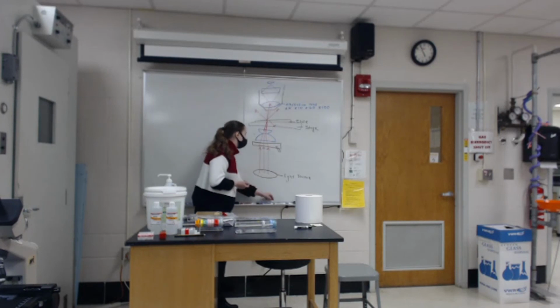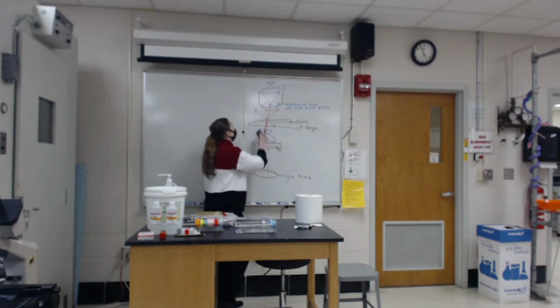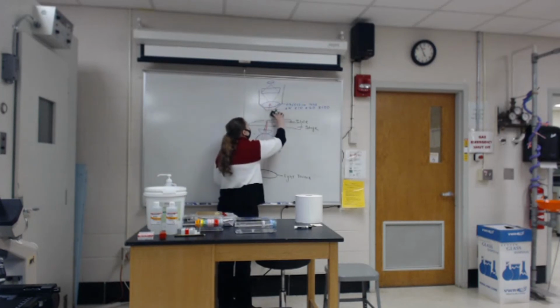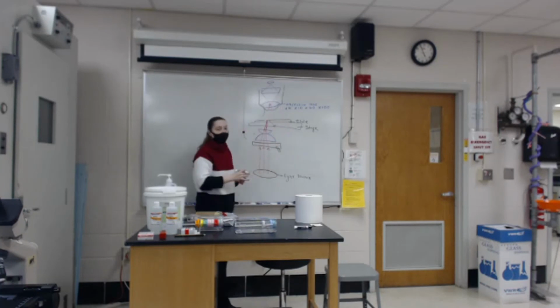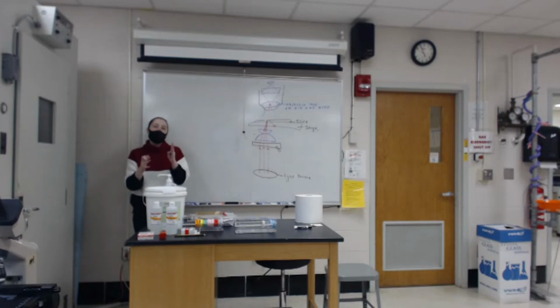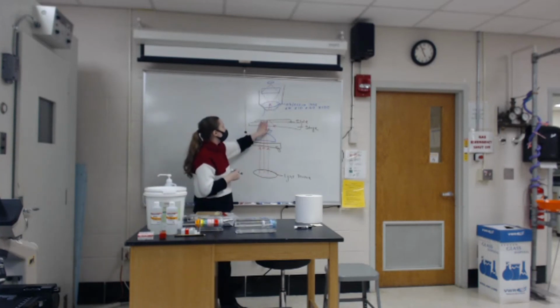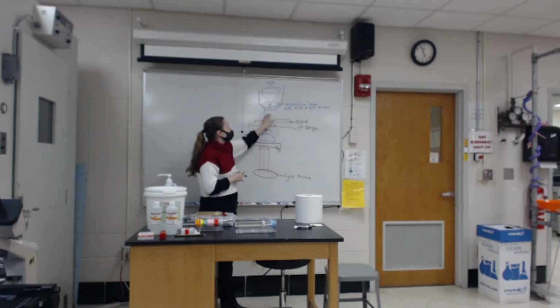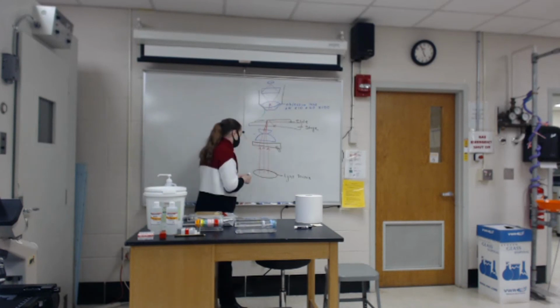So how do we deal with that? We're going to deal with that using the oil. When we're working with oil, we're going to put a little drop onto the slide, and this oil droplet is going to connect the slide and the lens. This oil is specially designed to work with microscopy and with this lens. And the important thing is that the refractive index of the oil is going to match that of the slide. So it's not really changing the type of medium it's traveling through.